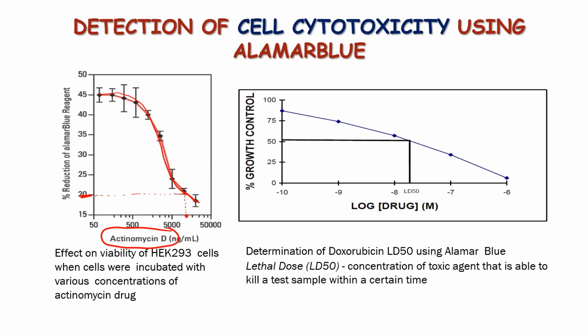And that is why the cytotoxicity tests are very important, because if you have this graph here, of course you will not be using 10K nanograms per milliliter in your experiment, because you would expect only 20% of the cells to survive this treatment. Actually, you would go lower than 50 nanograms per milliliter, because here you already have 45% survival of the cells at this concentration.